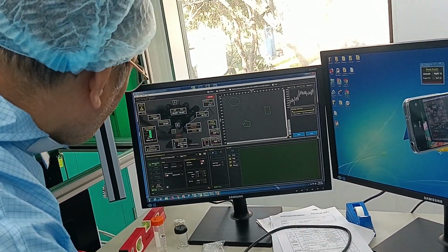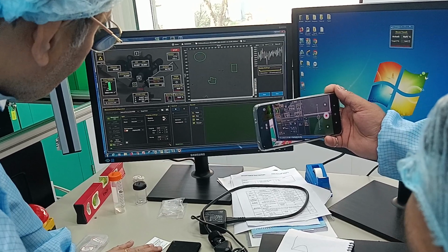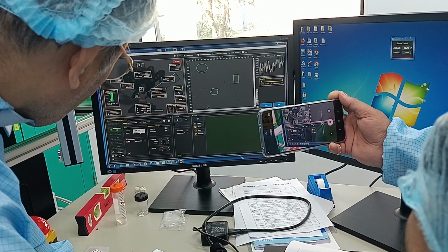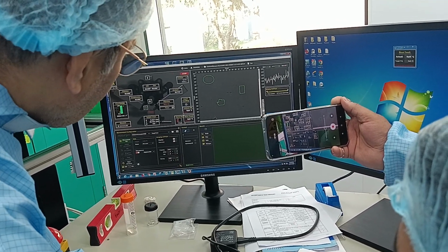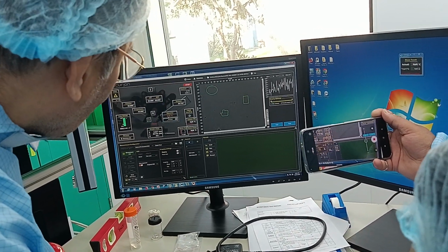Now we are looking at delta, standard RCE, a single point, and I'm not doing mapping, so I'll just switch off the mapping. It's a single zone, and I can also do a 2 zone to have more accuracy, but I'll just go for single to make it faster. And then there is no cropping, nothing. There is an option for auto save, and there are graphs, maps and all, which I'll show you, come back to that.